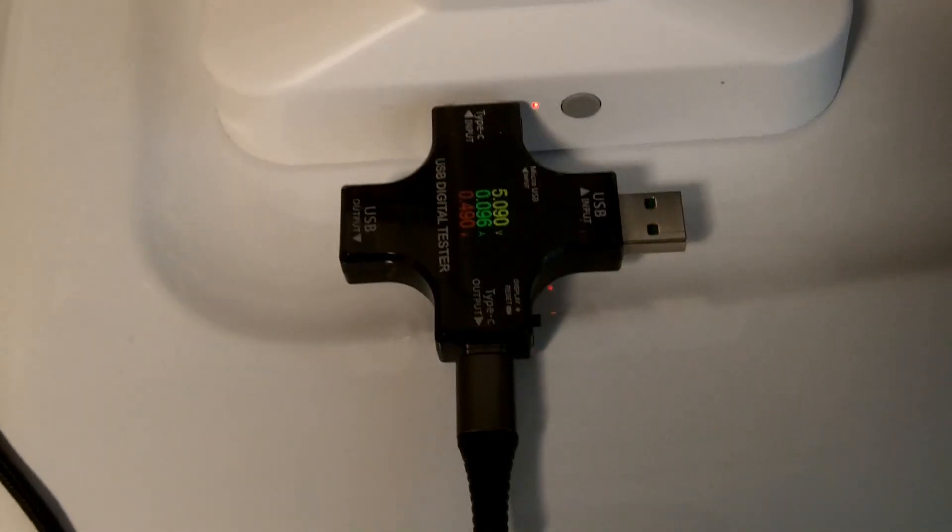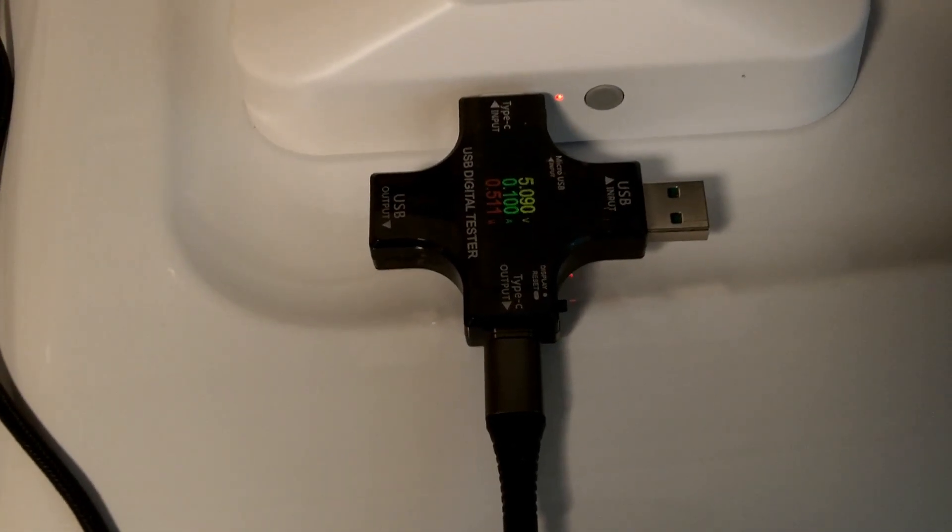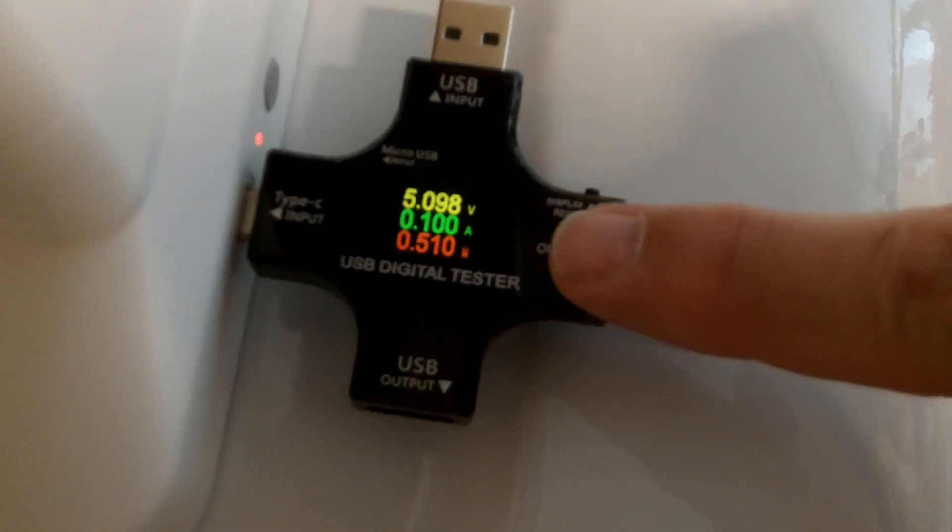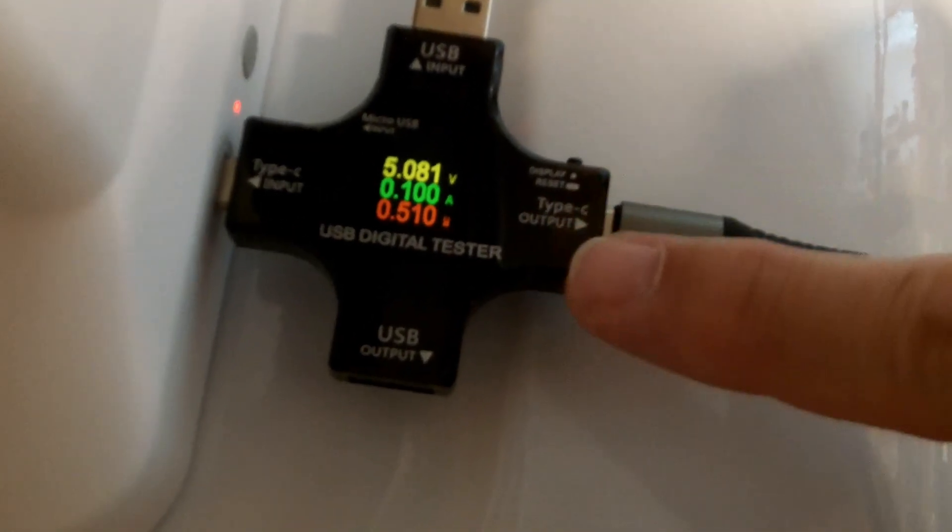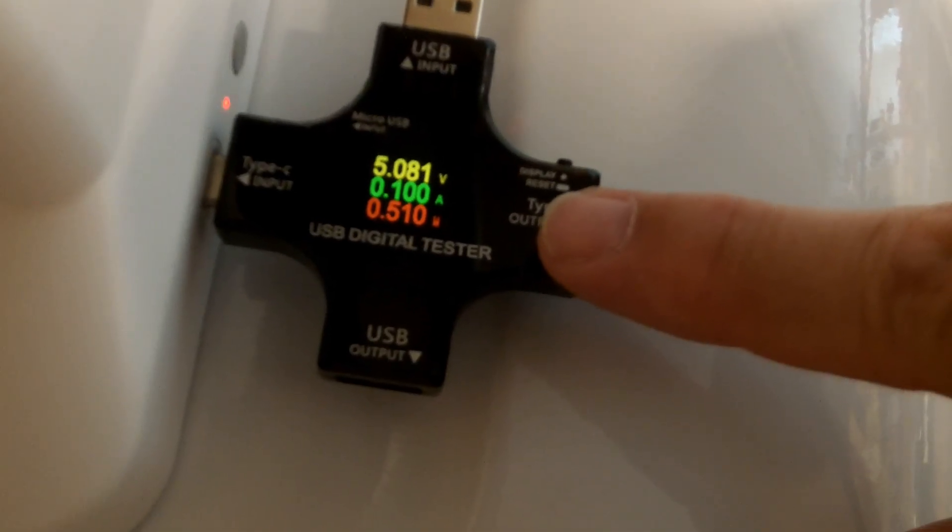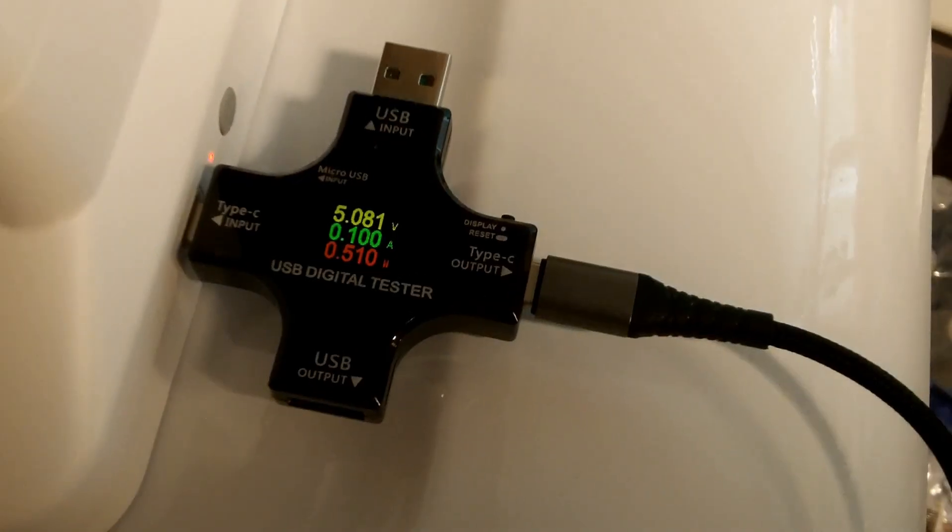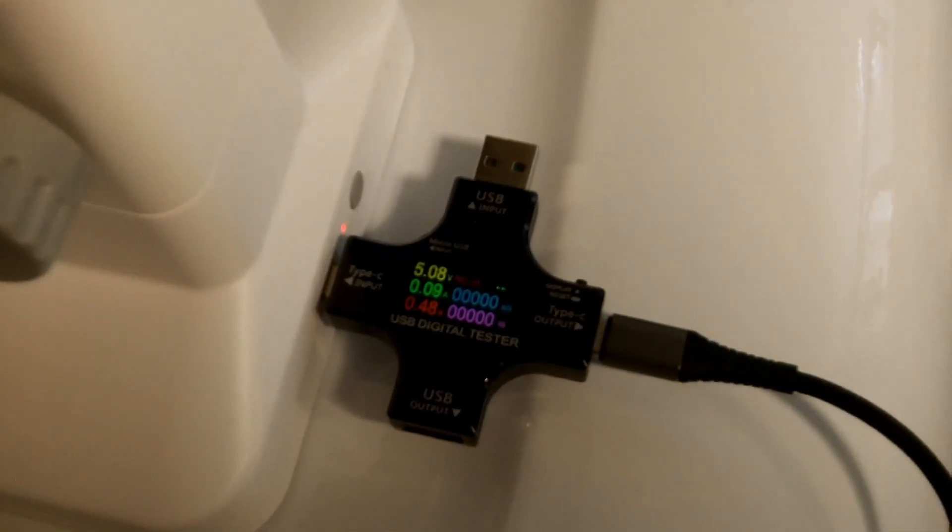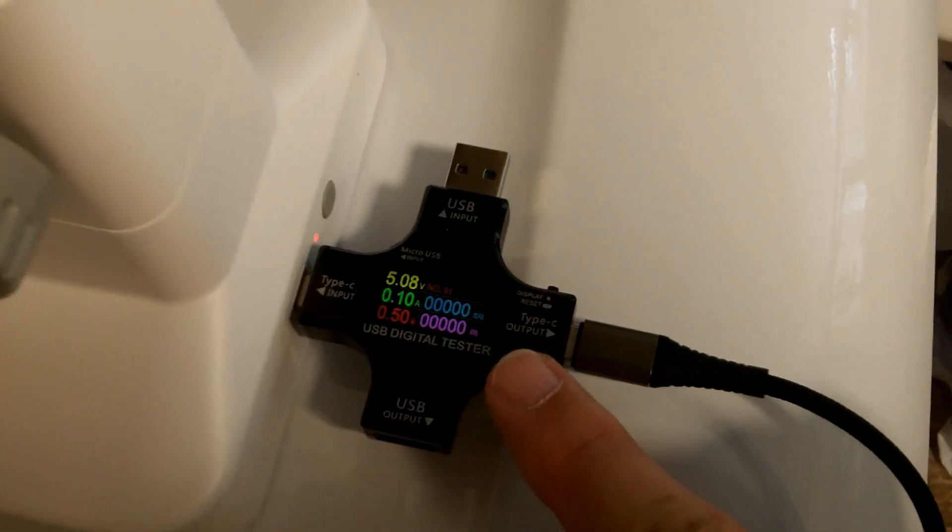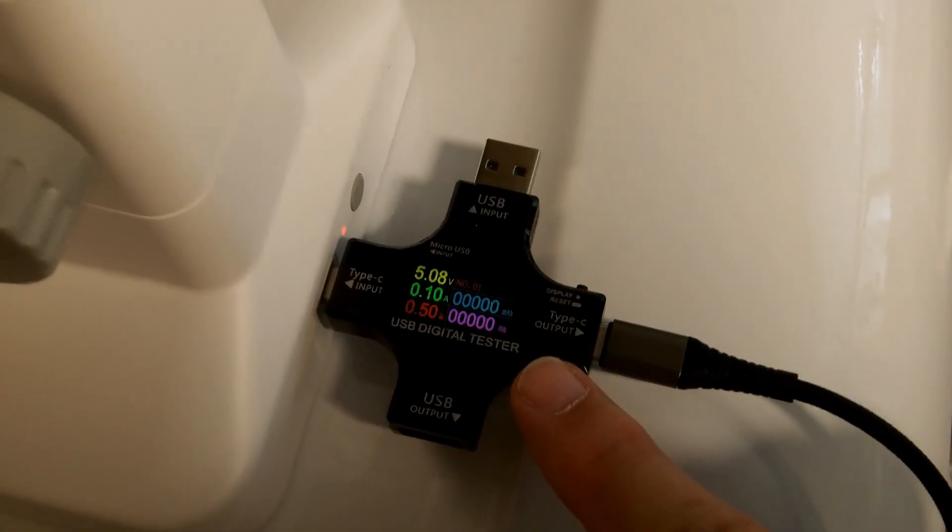I've plugged this into a USB-C power delivery cable. It does negotiate USB-C power delivery. The red light came on for charging. Now, it's drawing 5 volts, but it's doing a very low amount of current, like half a watt here. I don't know if it's doing that because it's fully charged, or if it's because the battery is so low that the BMS is ramping up the charging current very slowly. So I'm going to leave it plugged in until this red light turns off to make sure it's fully charged. And I'll check on it to see if the power goes a little higher later on. In case we are charging this up from a completely dead battery, I've reset my amp hour and watt hour counters here, and we'll see how much power it takes to charge that battery up.